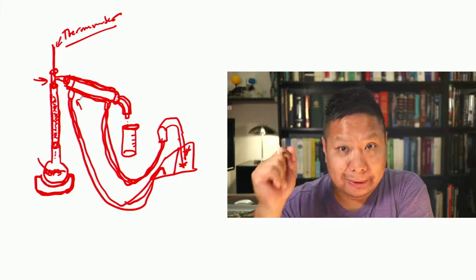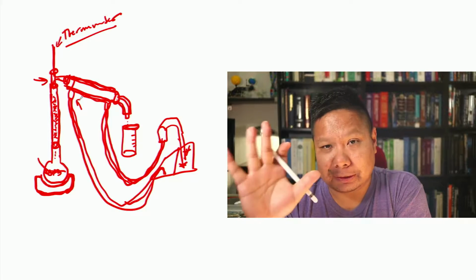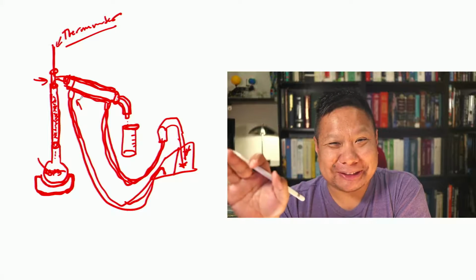So I told you guys about this one time when I flooded an entire lab on the third floor because this hose that I had up here popped off and the water was going everywhere. Not a good day. I had to evacuate the building, had to dry things. It was a bad day. Anyway, so make sure those things are very secure.